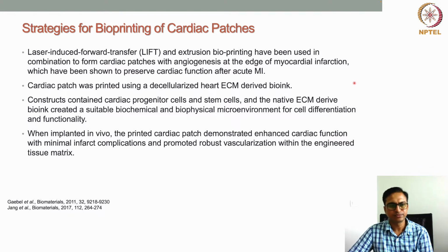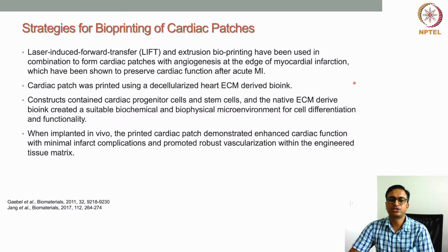If you see in the literature, both laser-induced forward transfer and extrusion bioprinting, which we have discussed earlier, work on different principles. In extrusion, we extrude the material in the form of a filament and print a structure. In laser-induced forward transfer, with the help of a laser, we forward transfer the material from the ribbon to the stage. These two methods have been well used for generating cardiac patches with angiogenesis at the site of the myocardial infarction, and this has shown huge promise to preserve the cardiac function.